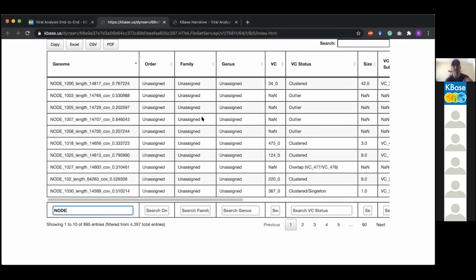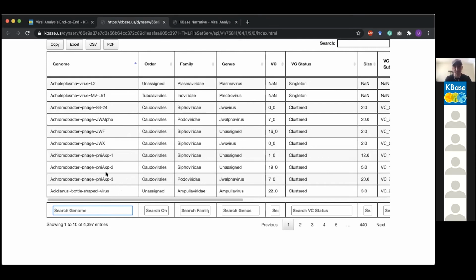And that is probably the number one biggest complaint people have had about vContact, is that these aren't assigned. That was a decision made very late in the process about whether or not to give the same credence to the assignment that all the references themselves have.